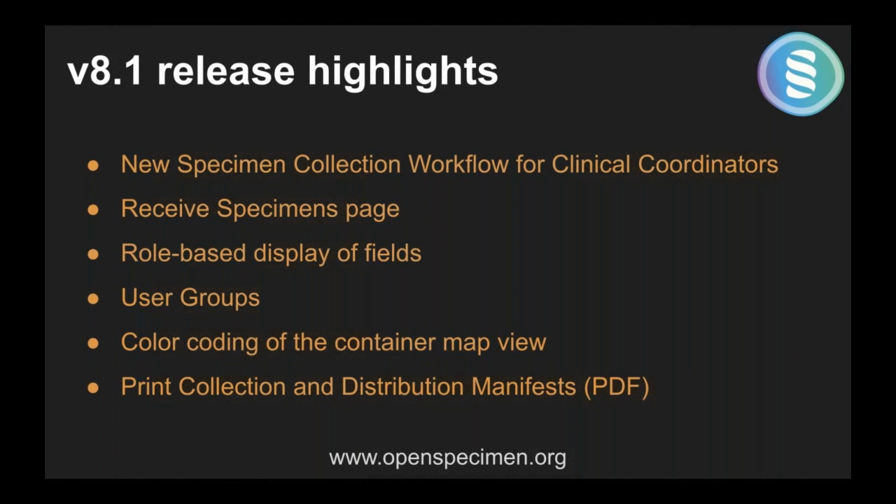So if you have staff who only do that much, there are new features that help you configure them to do just that and nothing else in the system. Receiving specimens is also linked to the clinic coordinator work, so I'll come back to that later. User groups, color coding, and printing PDFs on collection, distribution, and shipments are some of the other major new features.